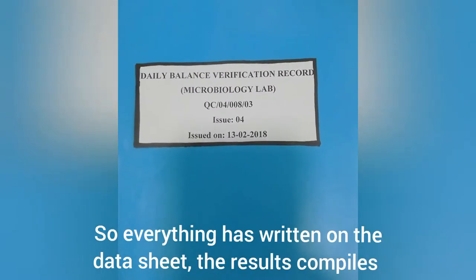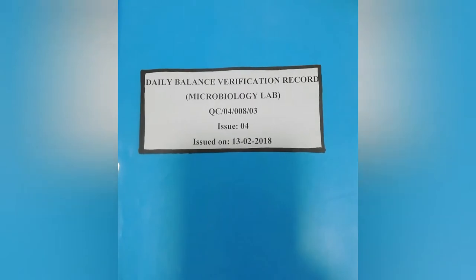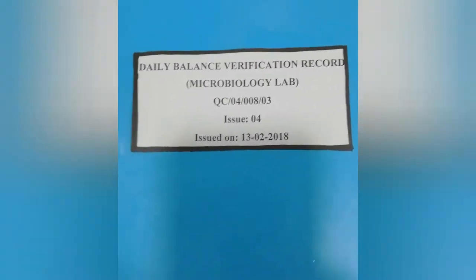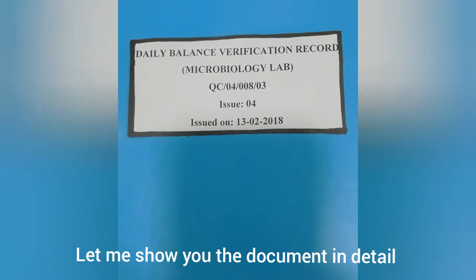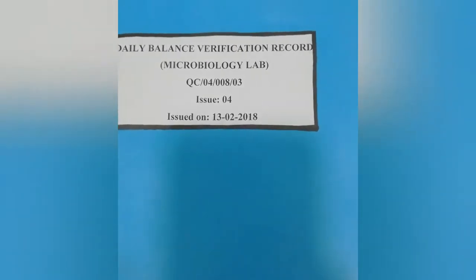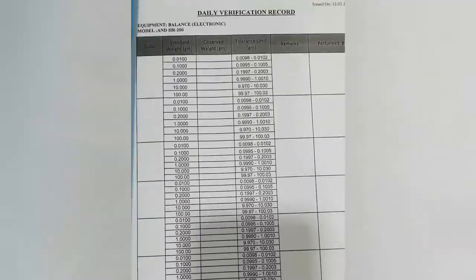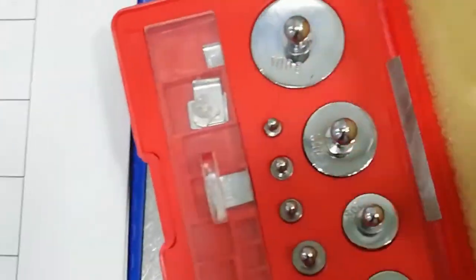Everything has been written on the sheet and the results comply. Let me show you how to write down the report and results. There must be a logbook for the analytical balance for daily verification. You must attach a tag on the logbook so it can be identified. There is also a calibration tag — everything needs a calibration tag.